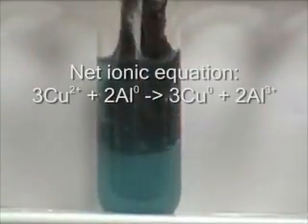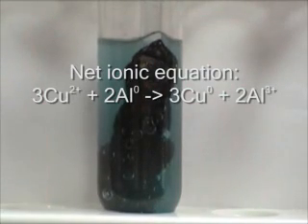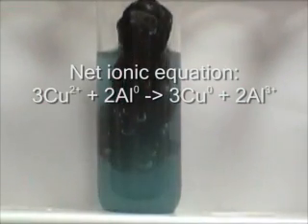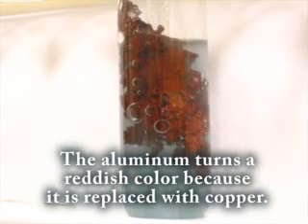The copper ions in the solution oxidize the aluminum. Likewise, the aluminum reduces the copper ions. The aluminum dissolves and is replaced by the copper, which causes a reddish color.